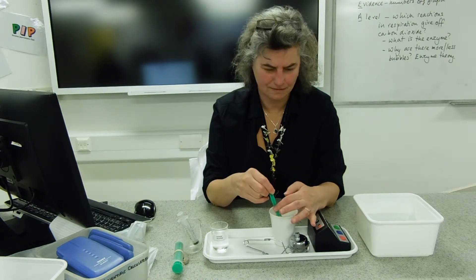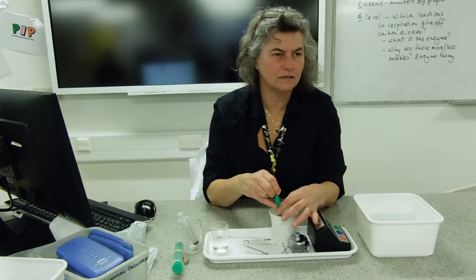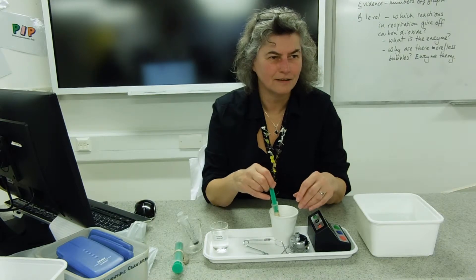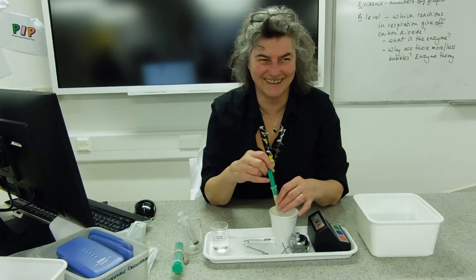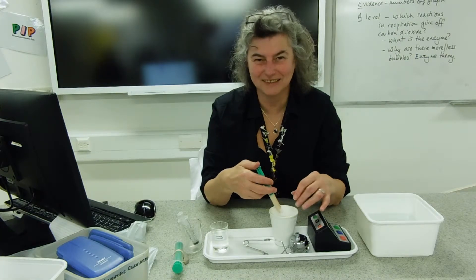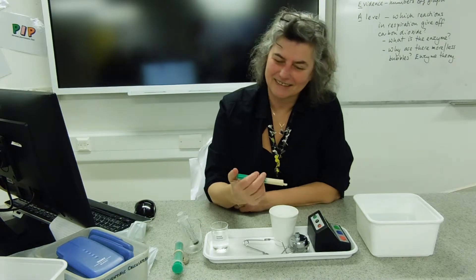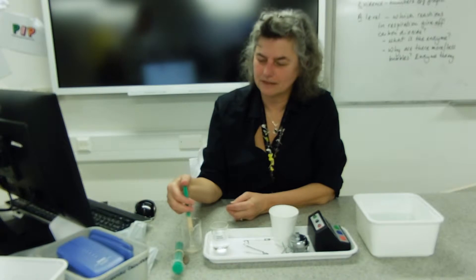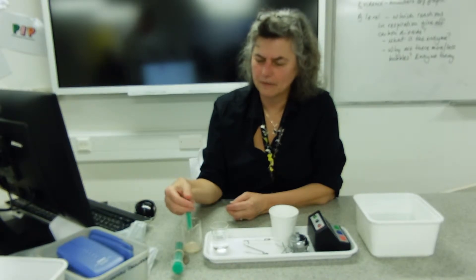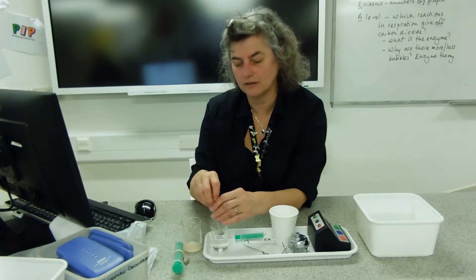There's yeast. We'll pop the yeast into the beaker, and the reason we're doing that is we're going to give it a substrate to act on. We're going to use sucrose solution.